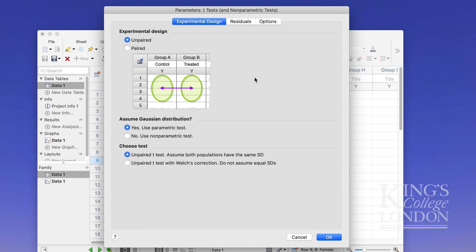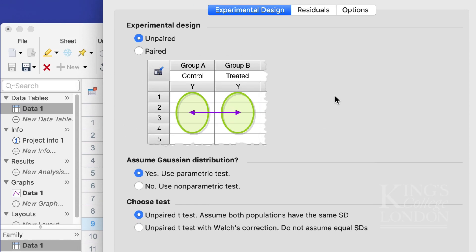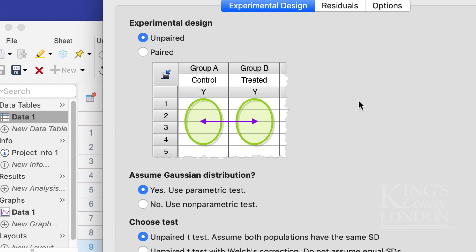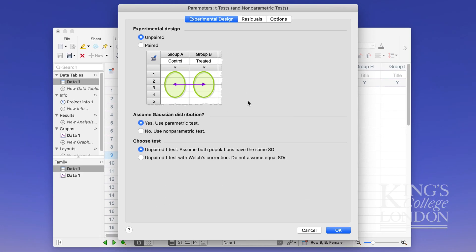If you had data which represented repeated measures between the same animal for instance or the same person before and after a treatment or over time you could use a paired test to compare one group to the other. With a paired test each of the rows in this case one two three four and five would represent a different sample.